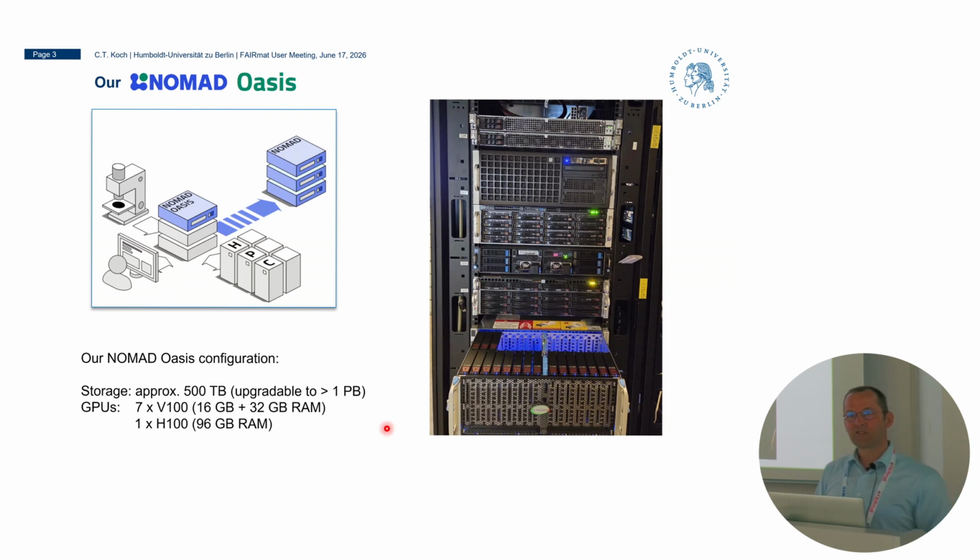But what we made sure of, and this was also a question that I was asked yesterday, is how do you make your data storage future-proof, especially when you have such large data sets? So we bought one of these JBOD extensions. It's basically a server that has only very limited computational power. JBOD stands for just a bunch of disks that you can add to your server, which then is the storage where all the data can be placed.